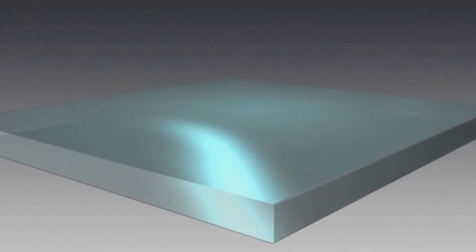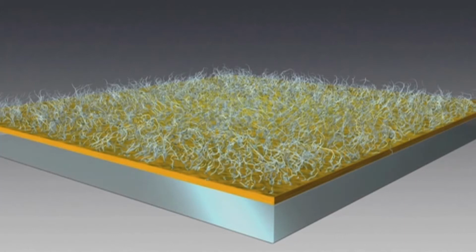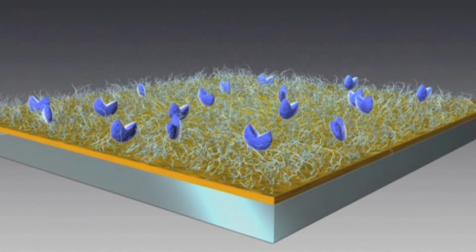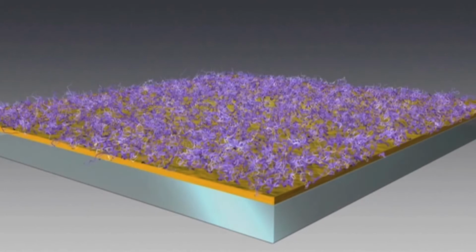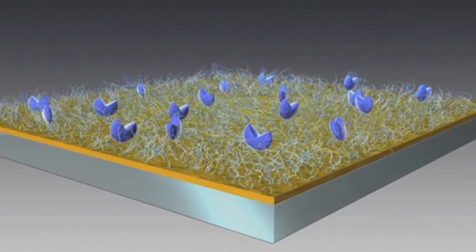A glass slide coated with a thin gold film creates the sensor surface. For most applications, a dextran matrix covering the gold film acts as a substrate to which molecules can be attached and provides a hydrophilic environment for the interaction. Other matrices can be used to attach specific types of molecules. The specificity of the surface is determined by the nature of the molecule attached to it.